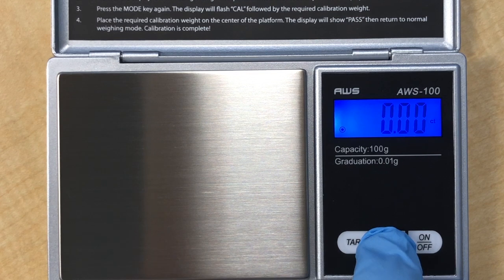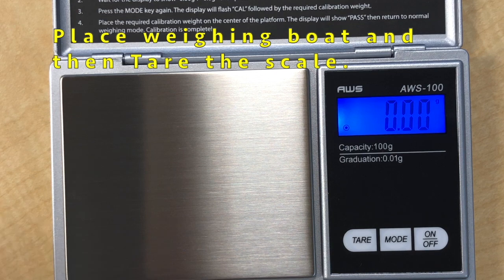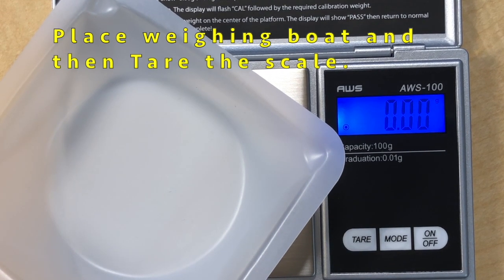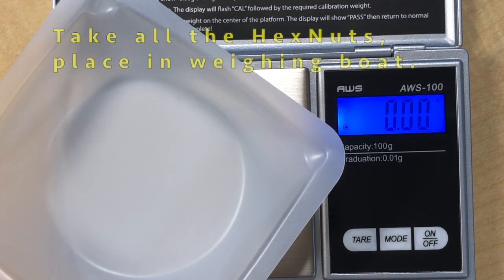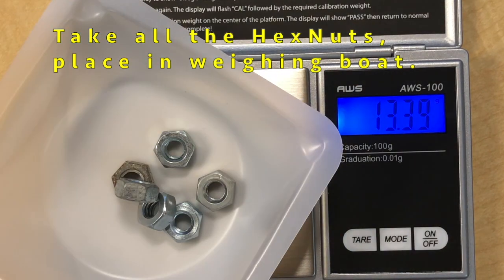We set the scale to grams with the weighing boat and then tare it. Tare means that the scale is set to zero so that the weighing boat will have no mass when the nuts are placed. Take all the nuts from your packet, place them on the weighing boat, and record the total mass.